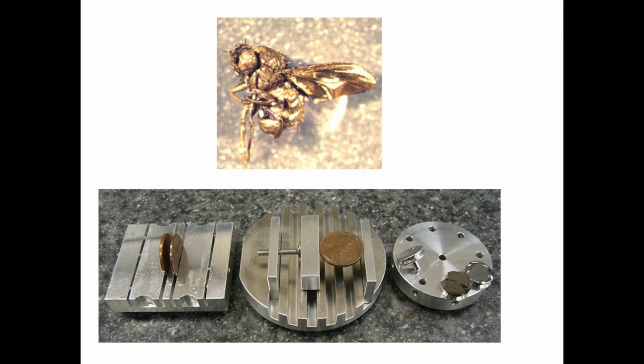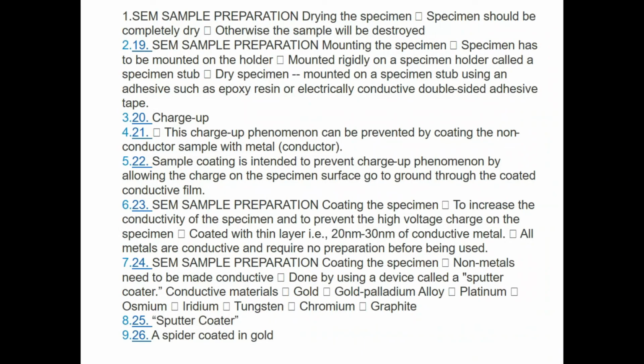Another point is that not only do we give the coating to biological samples. In biological samples we have to go for dehydration, because in all biological samples, including plants or animal species, there is some liquid content inside the body, so we have to dehydrate the sample before we use it. Otherwise water and other liquids may act as a dielectric medium and spoil the sample. So we should do that in addition to sputtering. Most probably it is gold, sometimes gold-platinum etc.